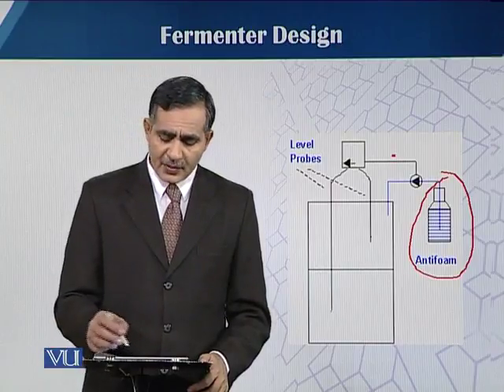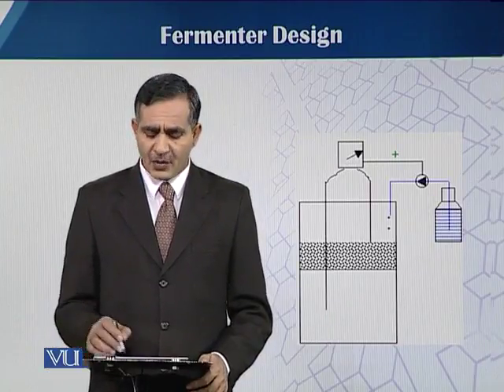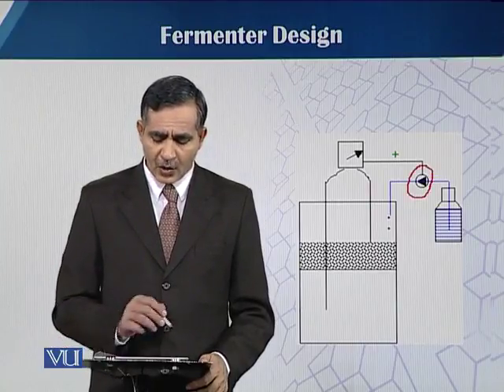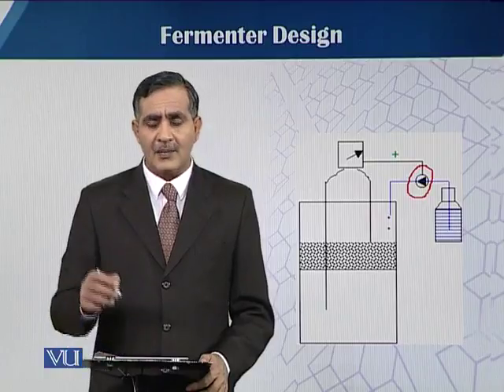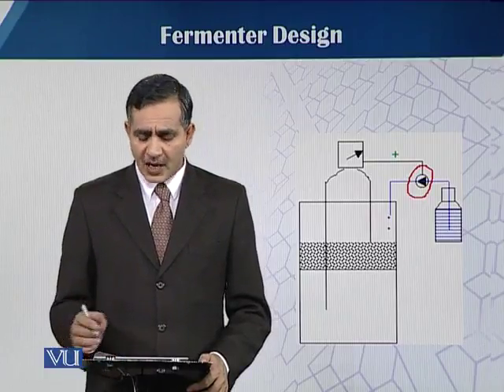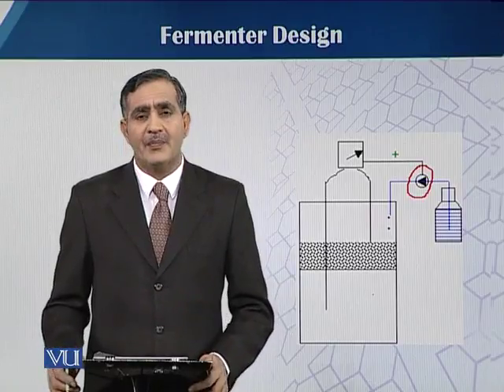In the next slide you can see when the foam is produced and touches the upper level probe, what happens? Then this pump turns on, sensed by the associated probe. Then a drop of the anti-foam starts entering the fermentation vessel.